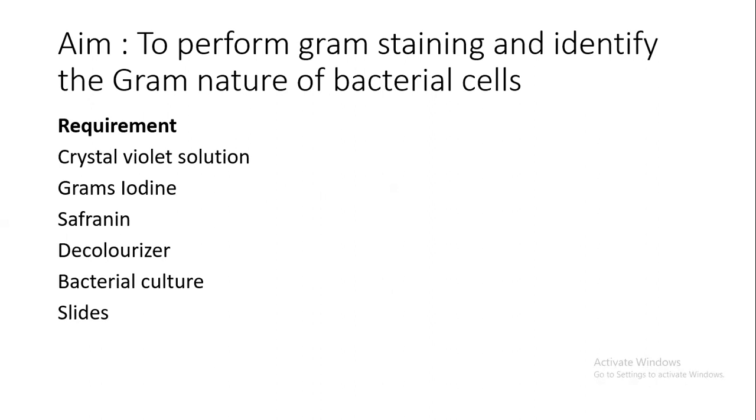The requirement for the experiment includes crystal violet stain, gram's iodine, safranin, decolorizer, bacterial culture for performing the stain, and slides.